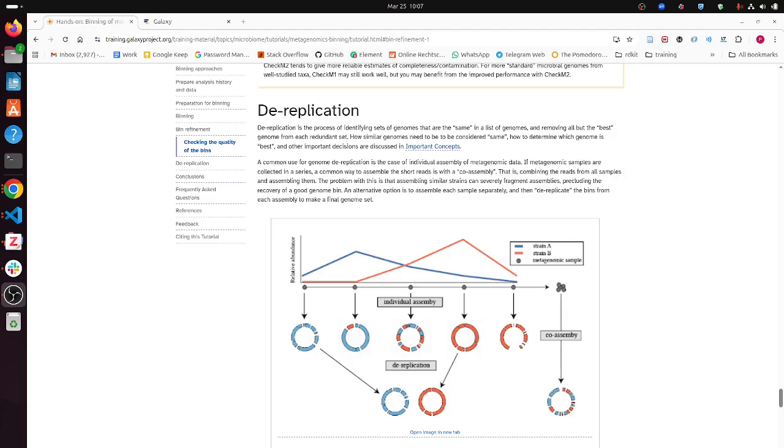And for example, since there is often a discussion whether or not MAGs found are reliable, because of course by this computational process there can be chimeric artifacts happening, I would say the more similar MAGs you find in a study or even cross study, the more reliable your MAGs are.